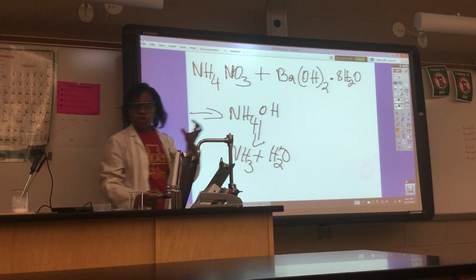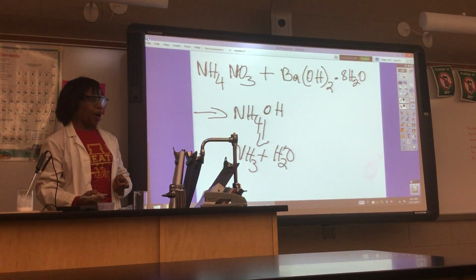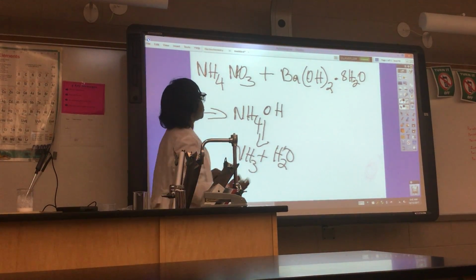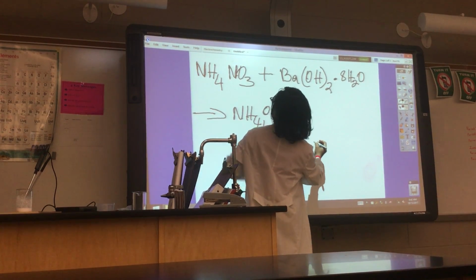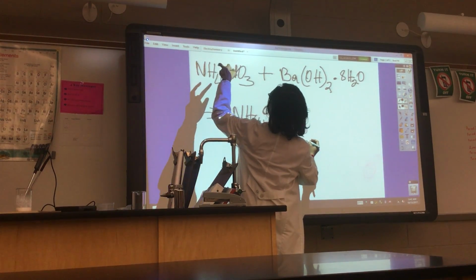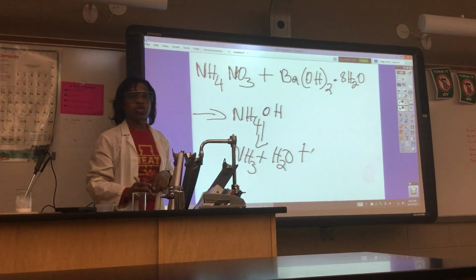Okay, that very strong smell is the smell of ammonia gas. Ammonia gas. It is a solution now. We have water molecules, and we also have barium nitrate. Did I do a double displacement? This is barium nitrate and ammonium hydroxide. We have a soluble salt.